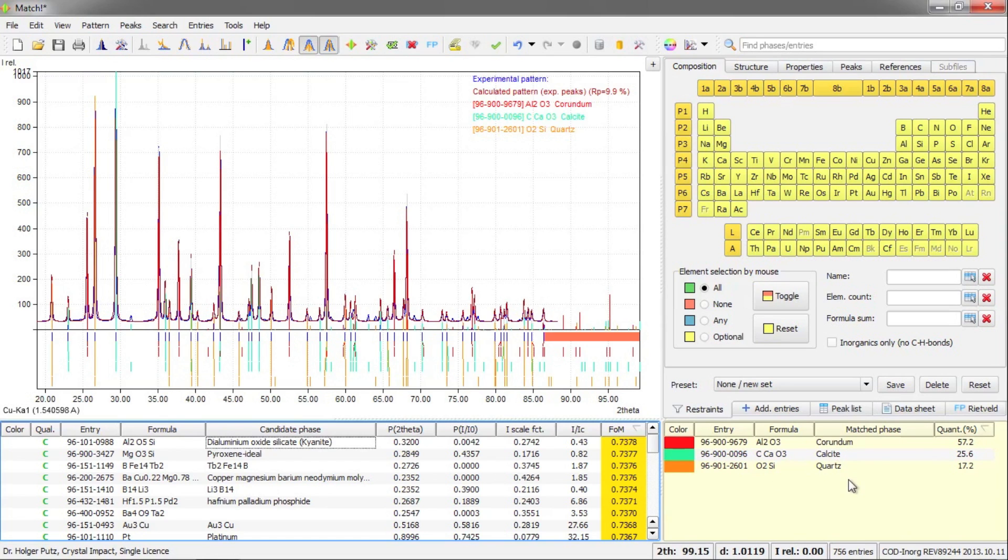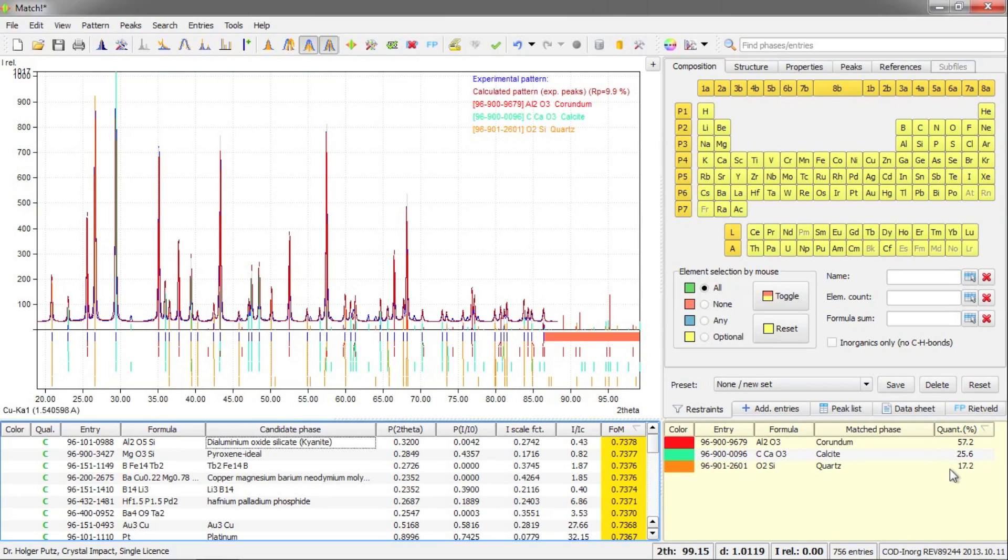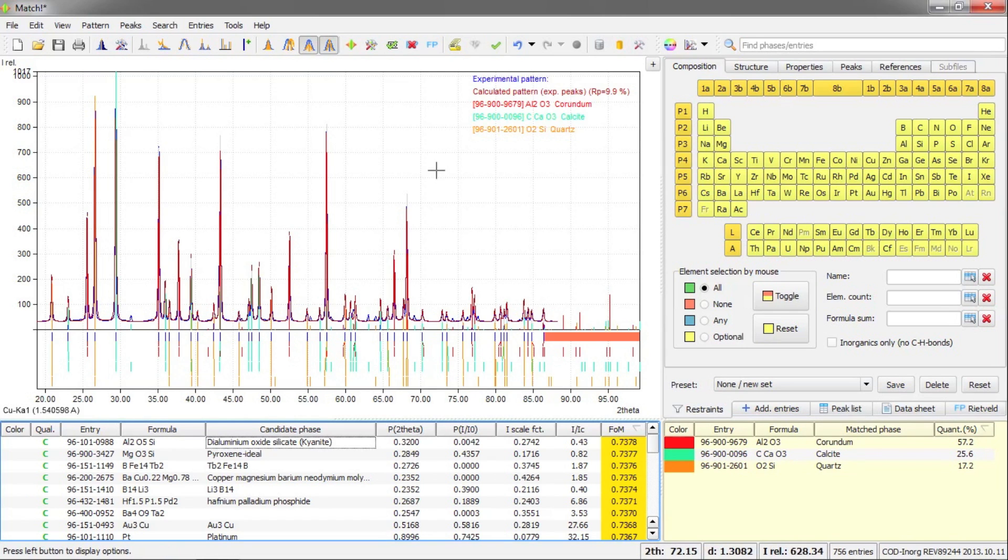We have three phases in our sample. And as you can see here on the right hand side, Match has already done a semi-quantitative analysis of the phases. So you have some estimations about the quantities that are in the sample. In order to get more exact values, I will now run a Rietveld refinement based on these phases and the raw diffraction data.